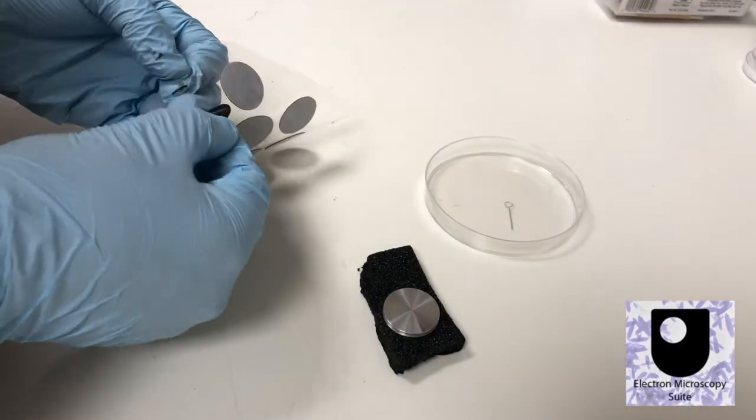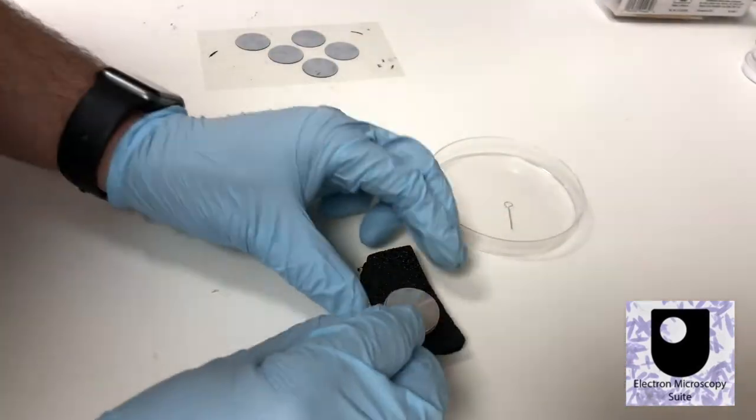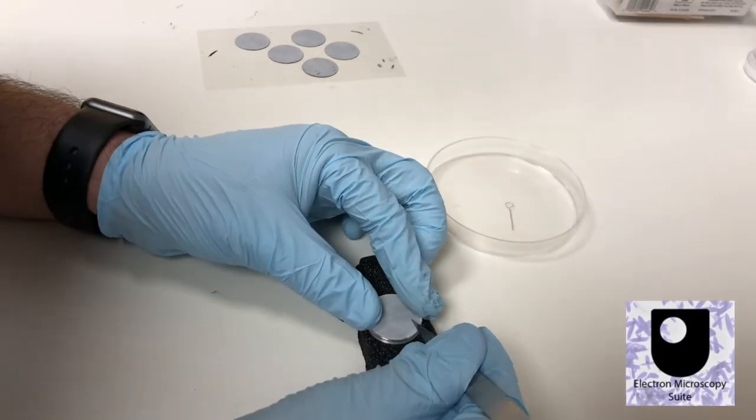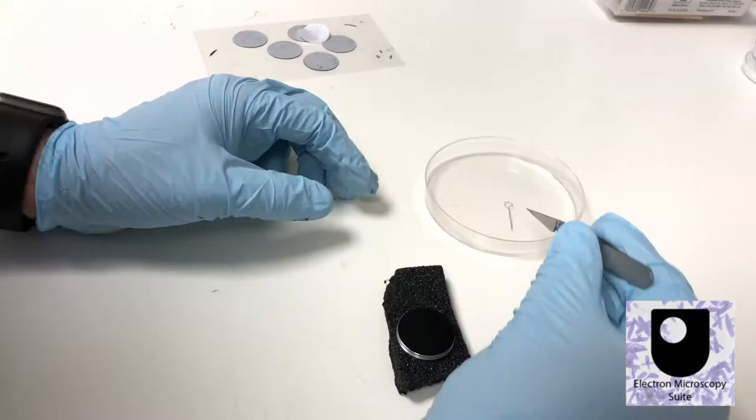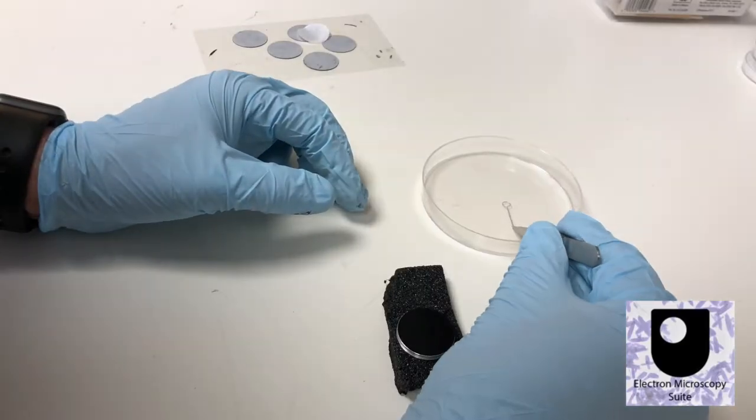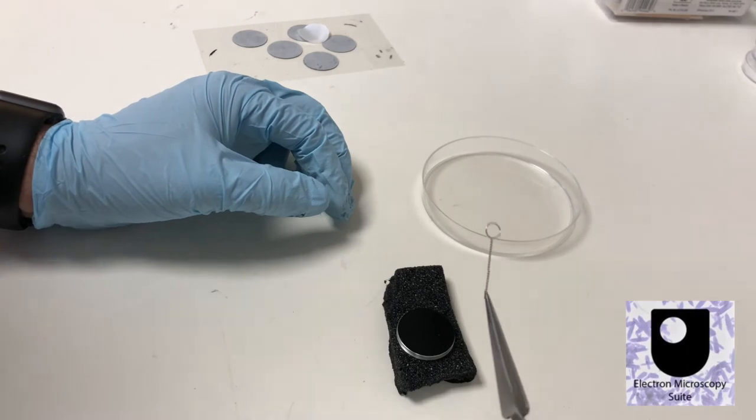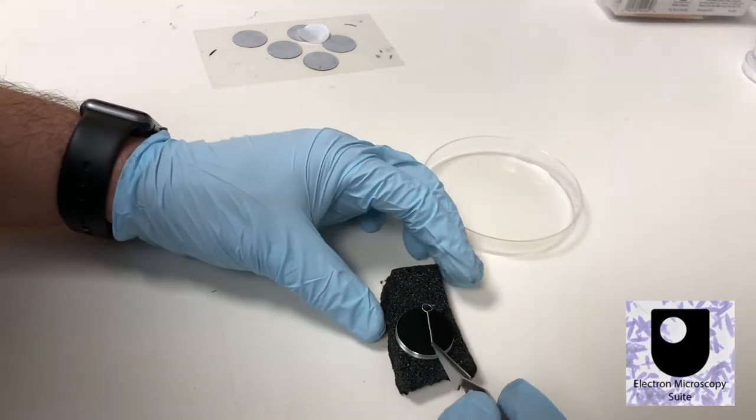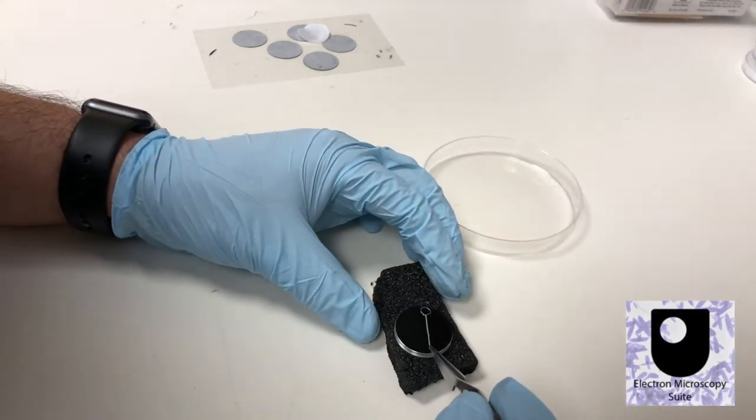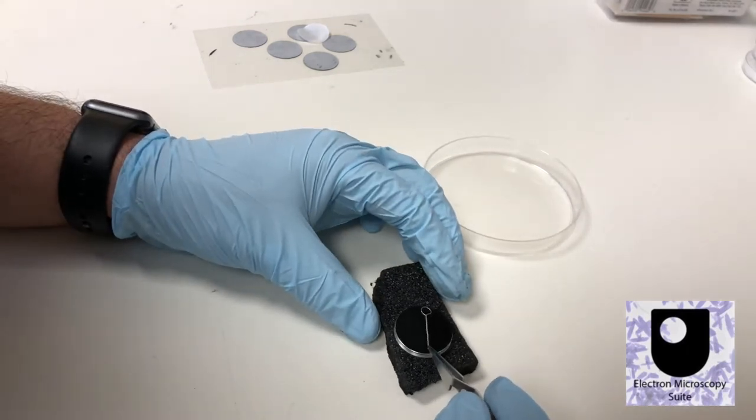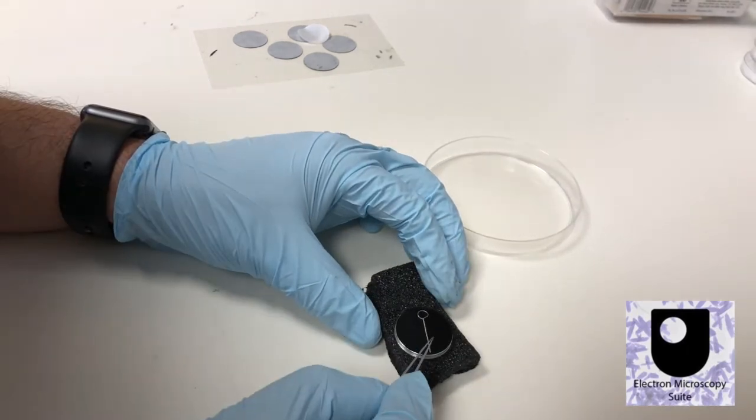Before being placed into the vacuum chamber, samples must be immobilized on a metal substrate. Double-sided sticky carbon tabs act as both an adhesive and an electrical conductor.